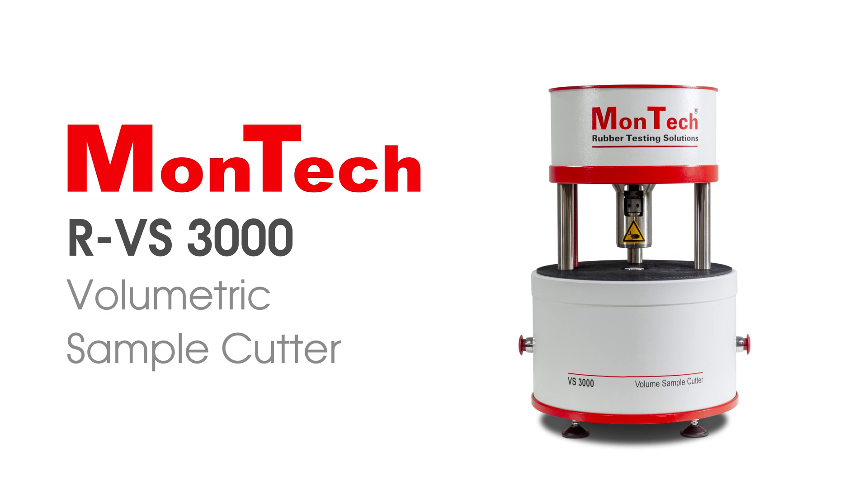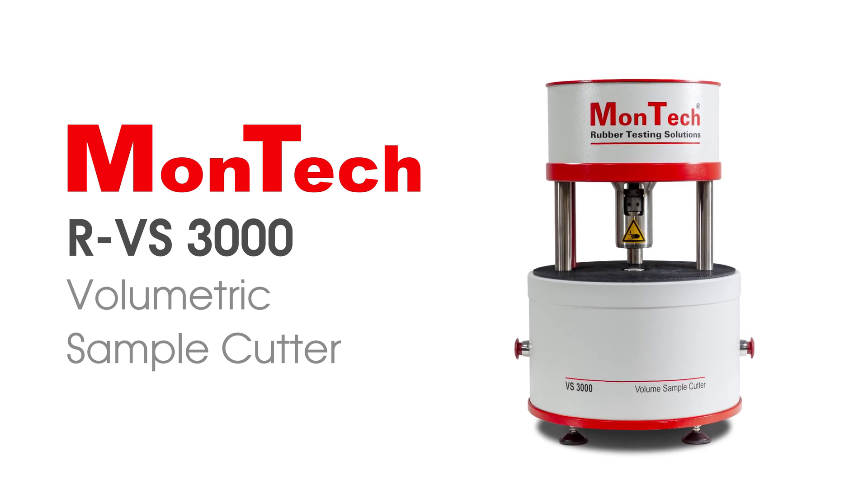MonTech's R-VS 3000 is the perfect solution for ensuring the most accurate and reliable results possible in your rheometer test. Contact us or visit our website to learn more.